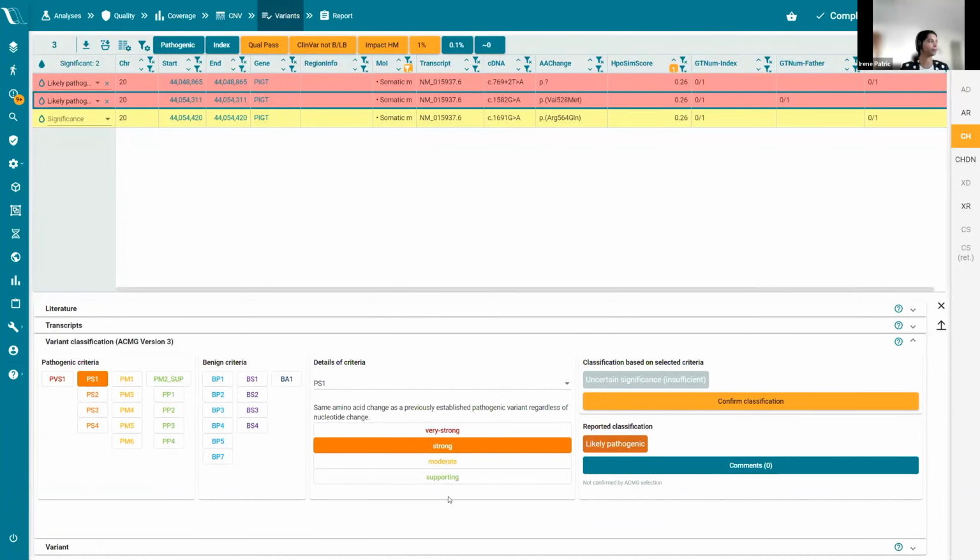Yes. And do you apply specific rules developed by clinician expert panels for classifying variants in certain genes? Is another question. So right now we cannot. We had it actually prepared, and if it's desired, we could implement it pretty easily.